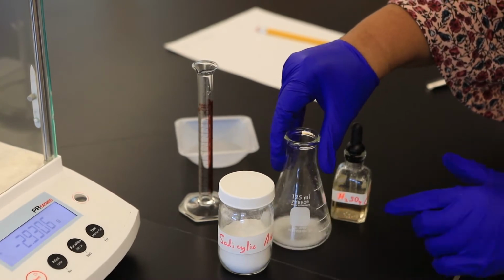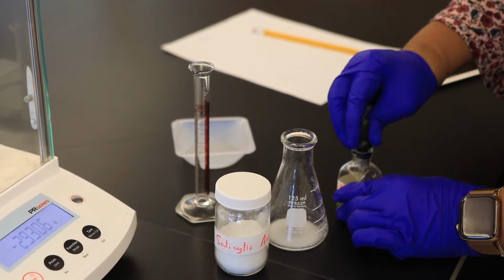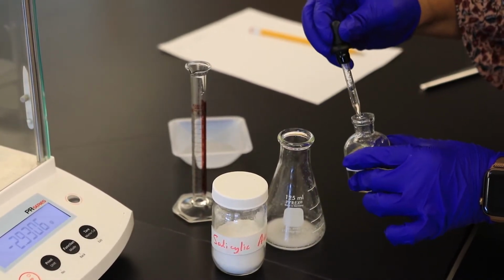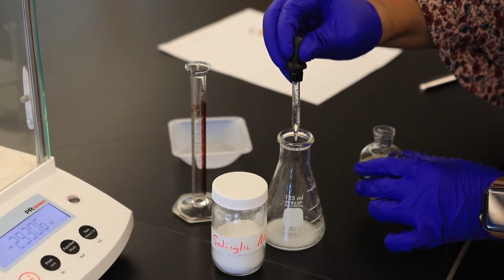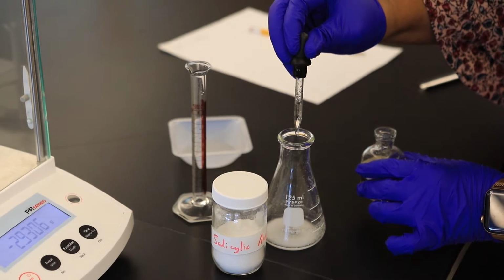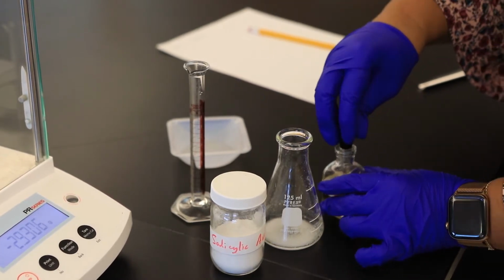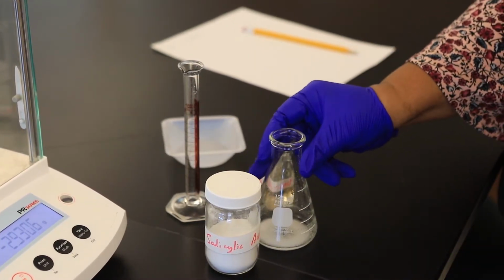I'm just going to swirl for a minute and then go ahead and add our 5 drops of concentrated sulfuric acid. Sulfuric acid is just being used as the catalyst. A catalyst, in chemistry, just increases the rate of that chemical reaction. So it's going to allow this to occur within that 20-minute period.